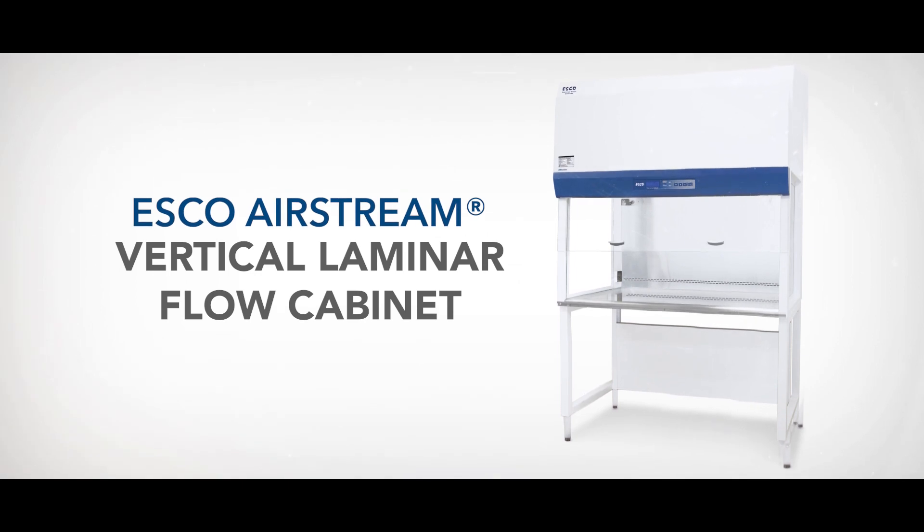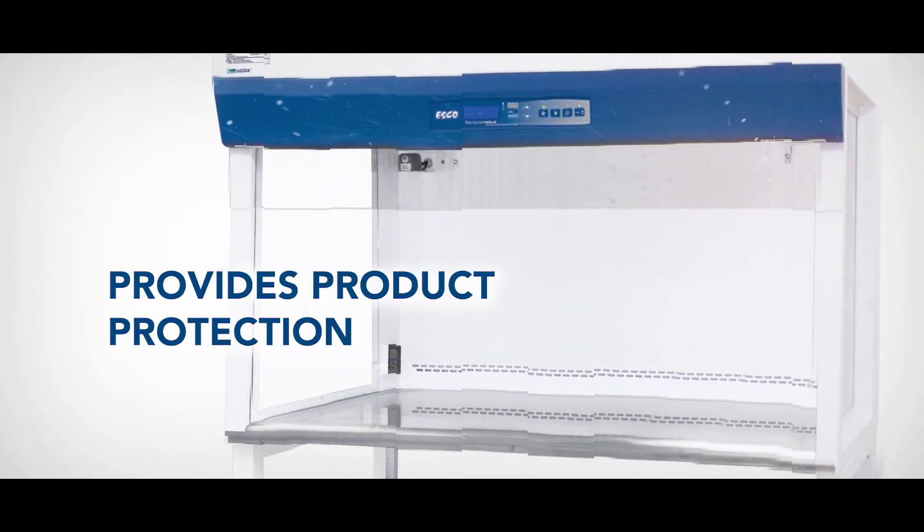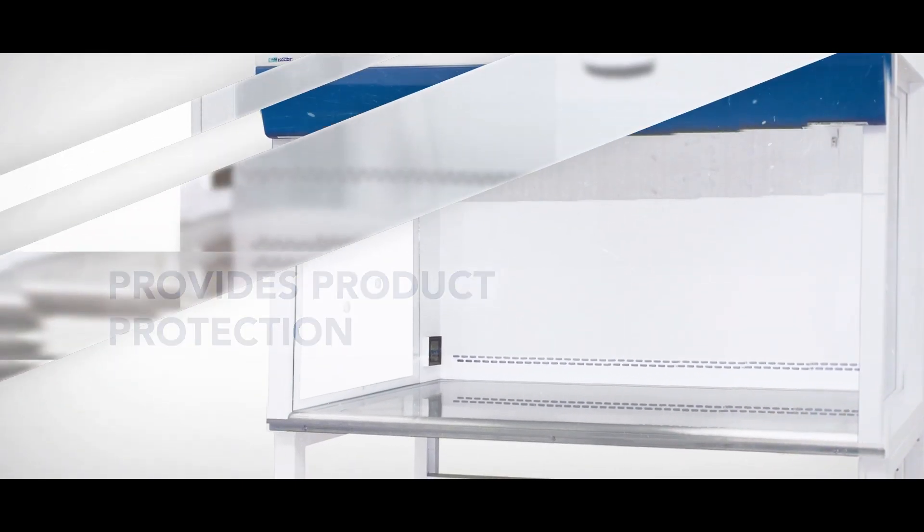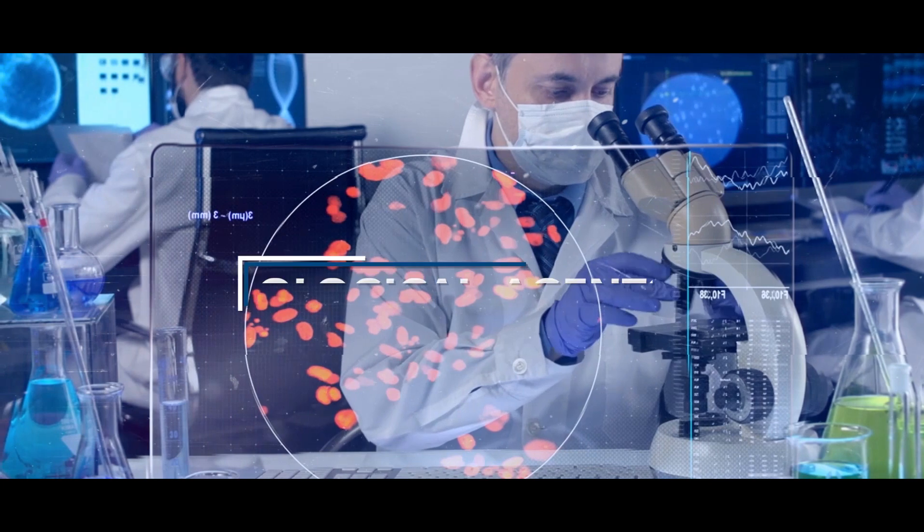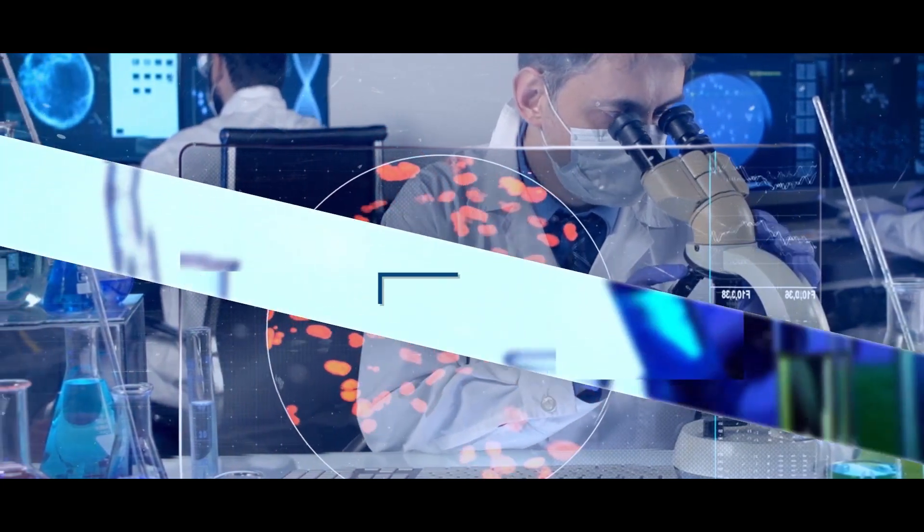The Esco Airstream vertical laminar flow cabinet provides protection of products and processes through the continuous supply of clean laminar air blowing across the work zone. It does not protect the operator and shouldn't be used when working with biological agents or chemicals.